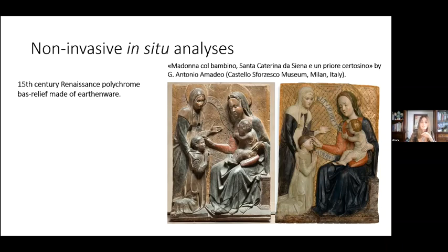On the occasion of this conservation work, a diagnostic campaign of the work was engaged in order to identify the pigments, primarily for helping the conservators both to intervene as properly as possible on the surface and then to verify the possible presence of incongruent materials caused by prior and undocumented intervention or restoration work.